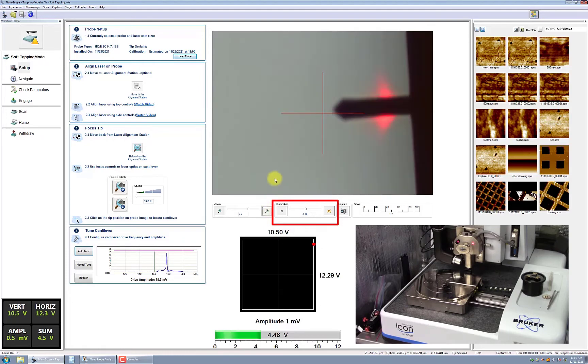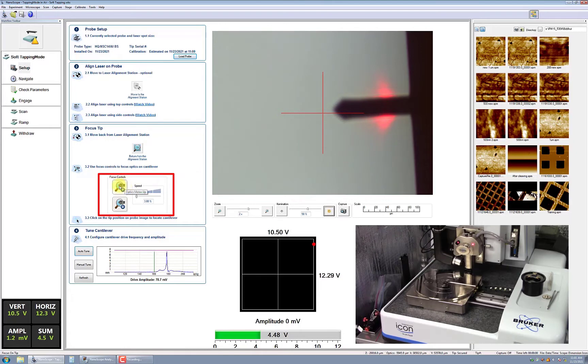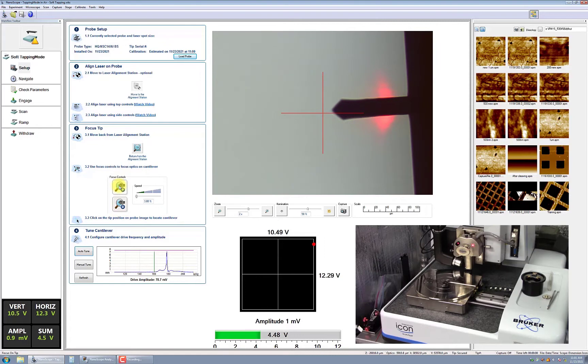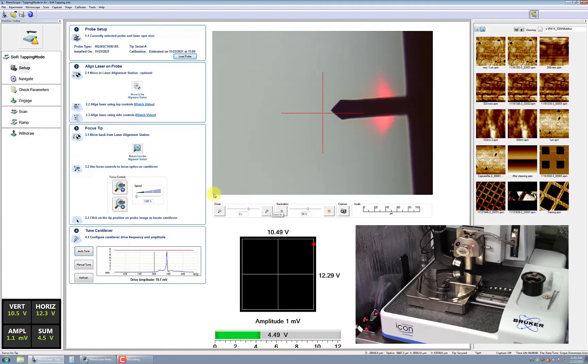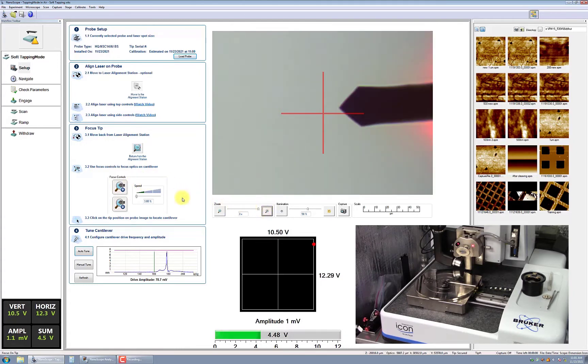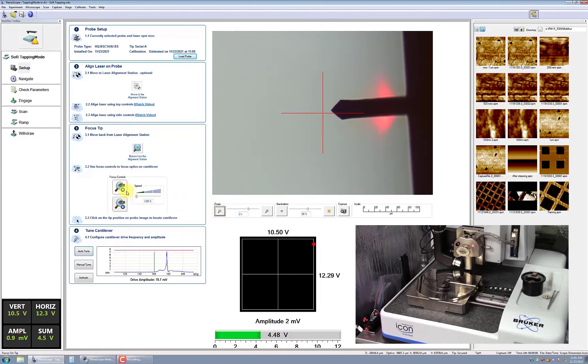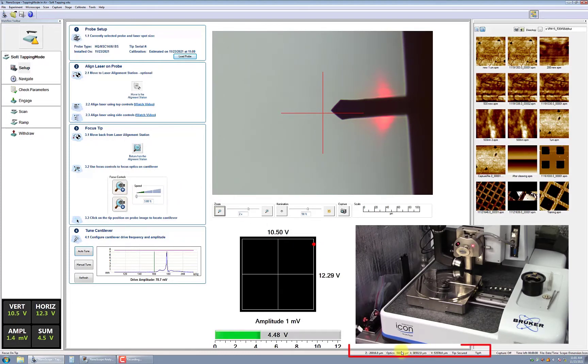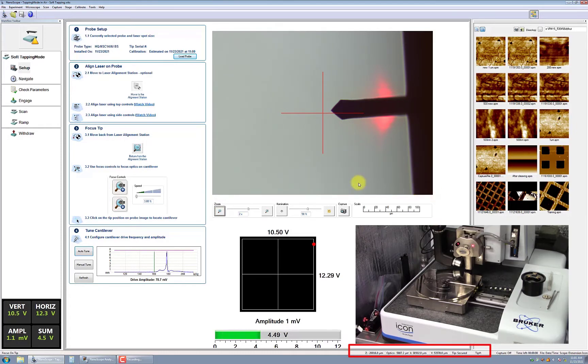In the next box, we will adjust focus. We can focus on the cantilever as reflected on the alignment station by adjusting the height of the scan head. You can adjust the speed of the scan head to the right of the focus buttons. As you get closer to a sharp focus, be sure to adjust your speed to the slowest setting to avoid crashing the scan head. You can note the approximate optical position in case you need this information for future troubleshooting. The optic location coordinates can be found at the bottom of the screen.